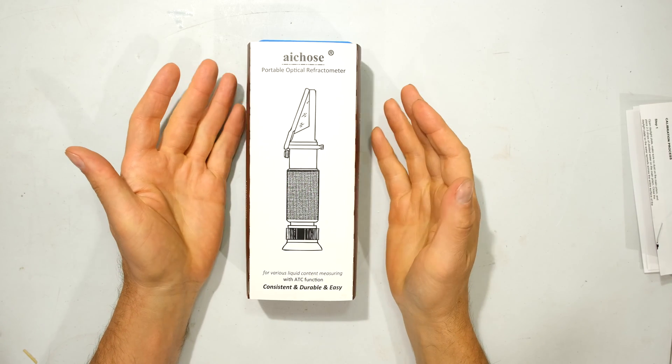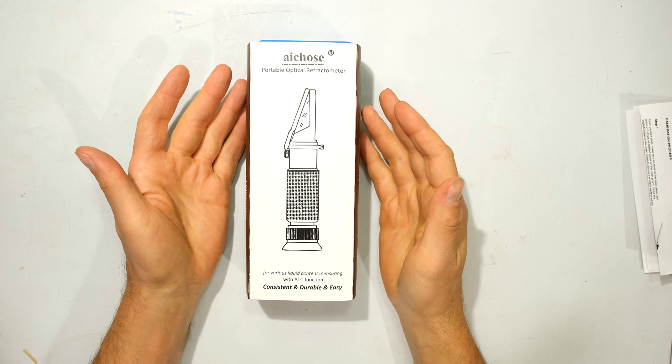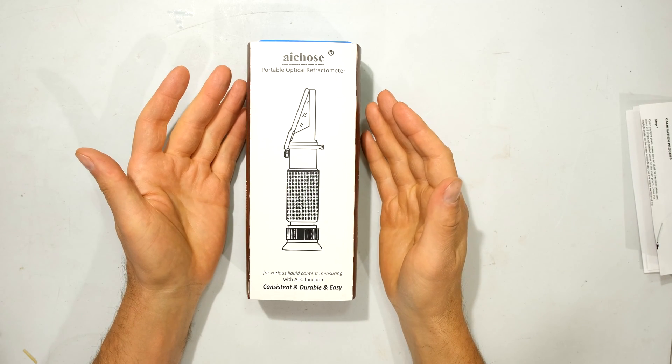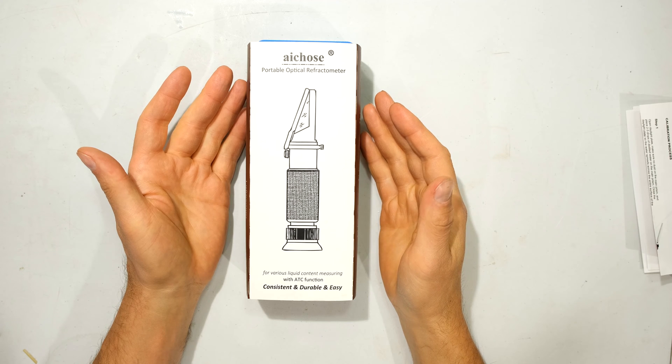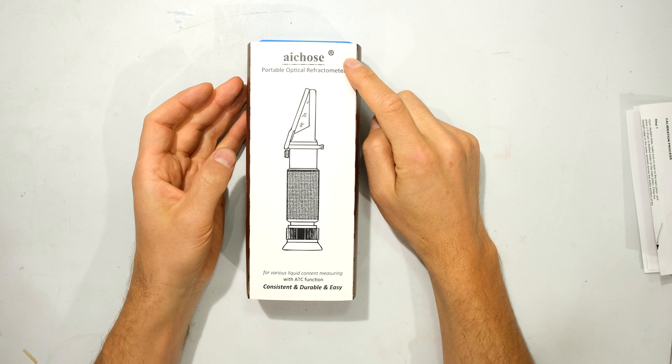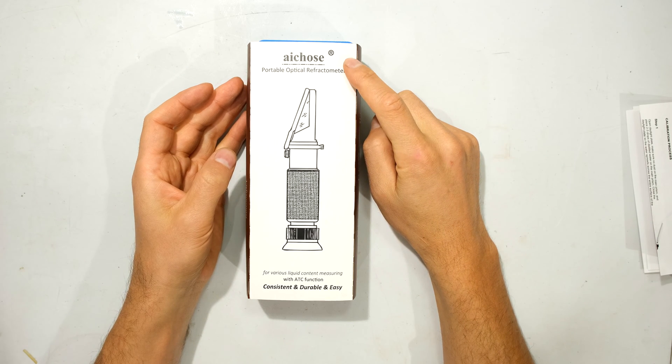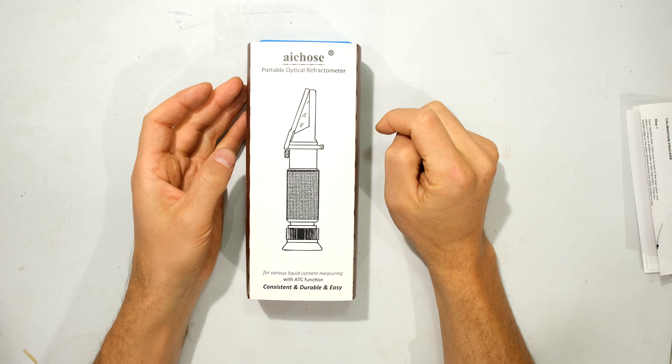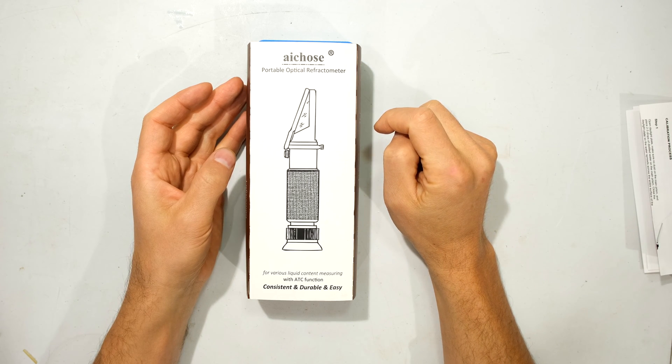Hi, in this video I'm going to demonstrate how to calibrate a portable refractometer. This is the model of the one that I'm going to be demonstrating.